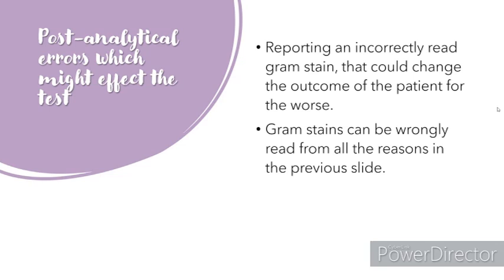So post-analytical errors, which might affect the test, only 2 things I could find really, which would be reporting an incorrectly read gram stain that could change the patient outcome. It might make them worse than what they were. So I really think anyone going into this field should double check the gram stain reportings to make sure that it makes sense with what you're seeing on the plate.